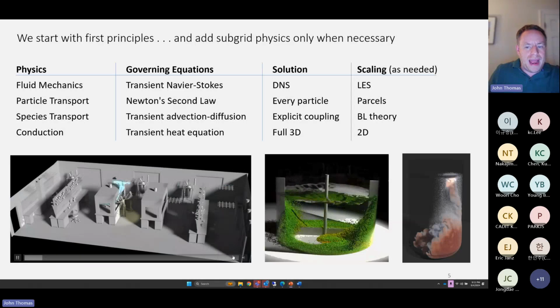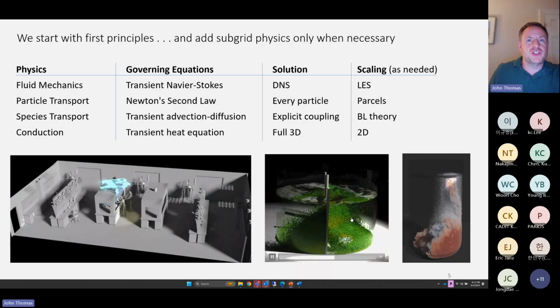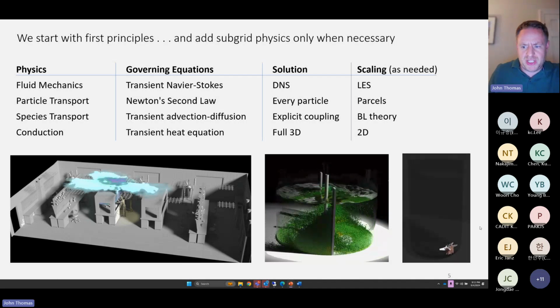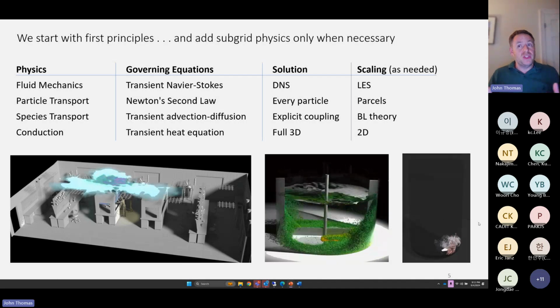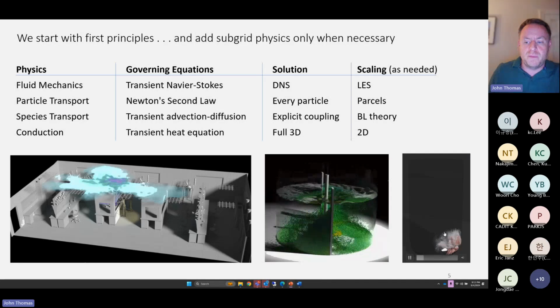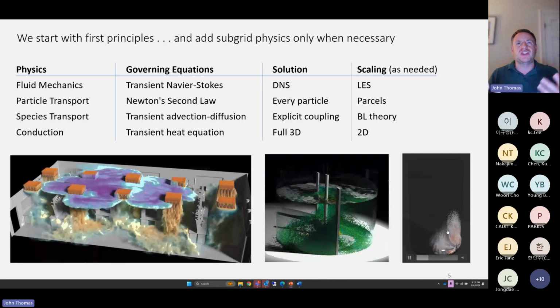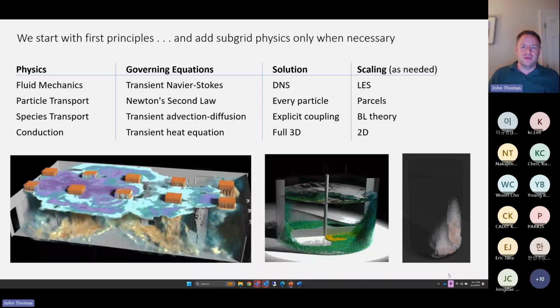We're trying to describe the behavior, the physics, in terms of the actual constitutive behavior. Likewise, for species transport, we are using a finite volume-based approach to describe the evolution of species, but we're doing explicit coupling to the solids. We're doing explicit coupling to the bubbles.